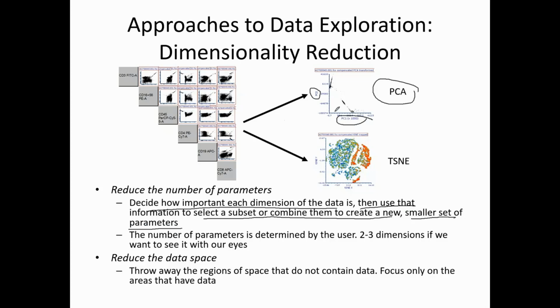And in this little combination, you can see that if I combine all of the data from my 6 colors, I can actually see multiple clusters here on a single graph. And those clusters are comprised of a combination of all the parameters together. So one would argue that there's actually 3 different cell types here potentially that are pulling out. Whereas when I look at all of this data here, it's very hard to see those cell types without further gating or doing any further analysis.